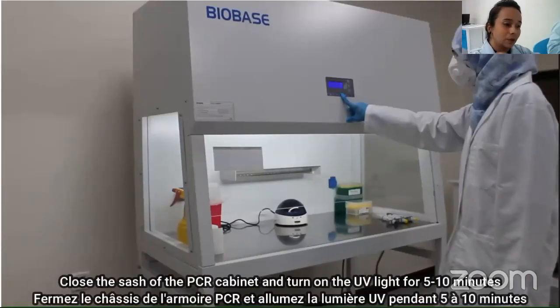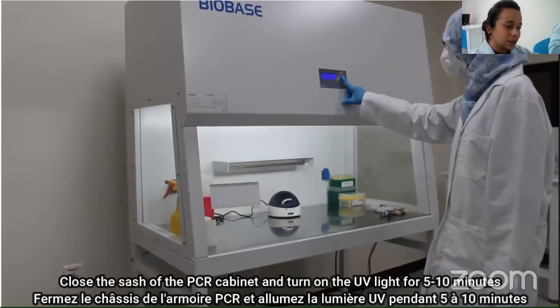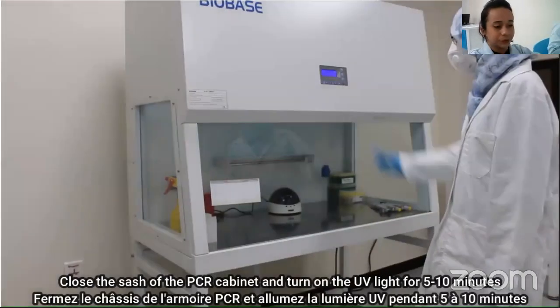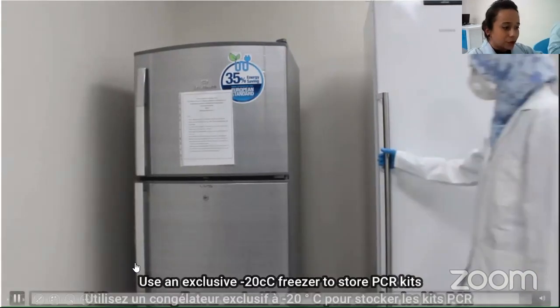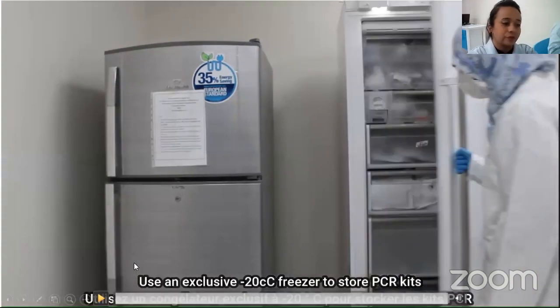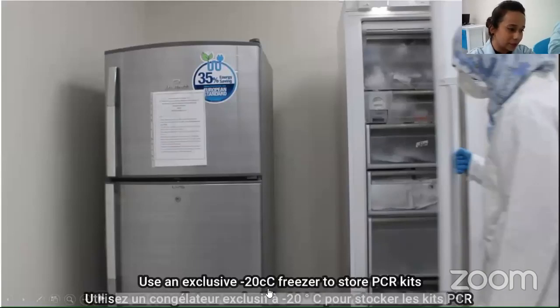We also clean all the small equipment as well, including the micropipettes. Close the sash of the cabinet and turn on the UV light for 5 to 10 minutes. For storing, we use exclusive, or dedicated, 4° and -20° freezers for storing the PCR kits and reagents.